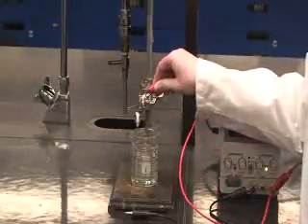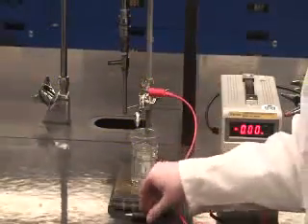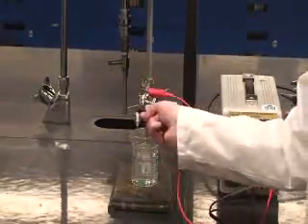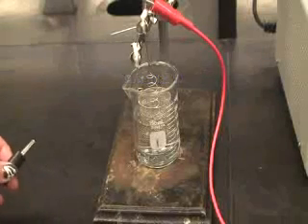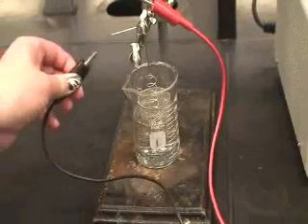Using the remaining red alligator clip from the amp meter attach it to the anode and using the remaining black alligator clip from the amp meter attach it to the cathode. A small spark may occur when attaching to the cathode.